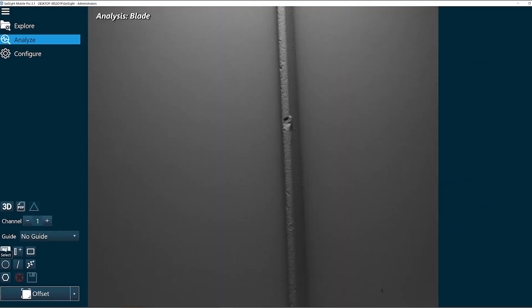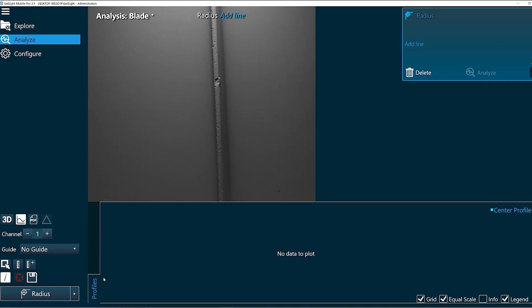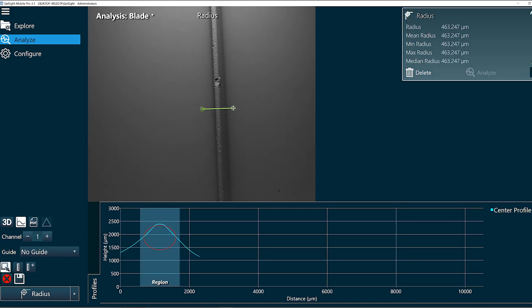I'll go back to analyze and let's say we want to measure the radius of this part of the blade. I'm going to add a radius function and I'm just going to draw a line across the profile I want the radius of.